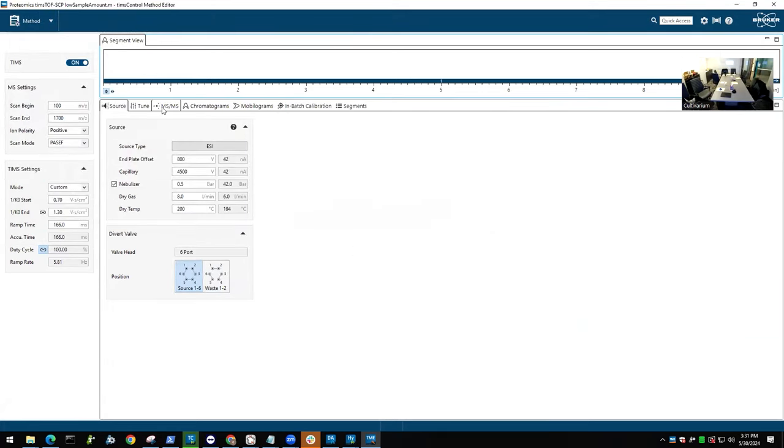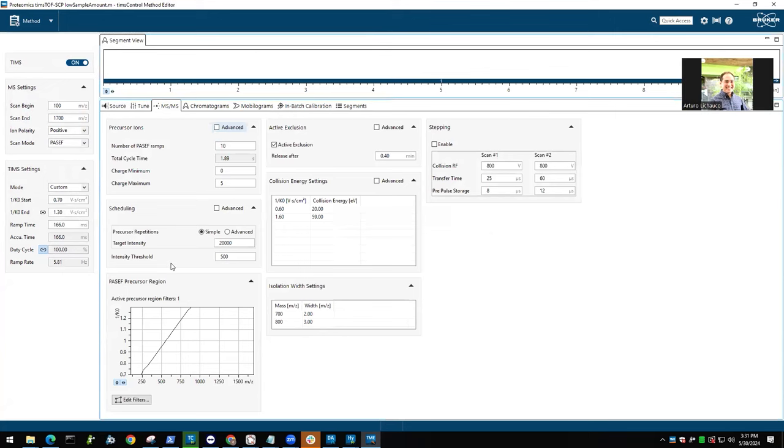This would be a standard DDA method, which we typically use with certain numbers of precursors being analyzed in a certain number of MS2s. So here we would do 10 MS2s at higher accumulation time. On the Astral, on the Ultra, we actually went back to 100 milliseconds because the sensitivity is good enough. But I would recommend when you do 16-plex to reduce the number of MS2s. I typically use 5.